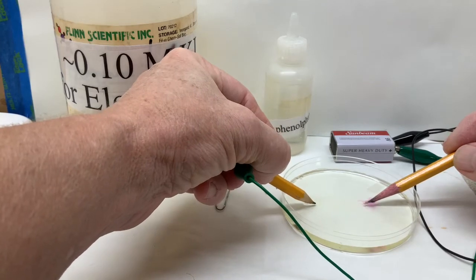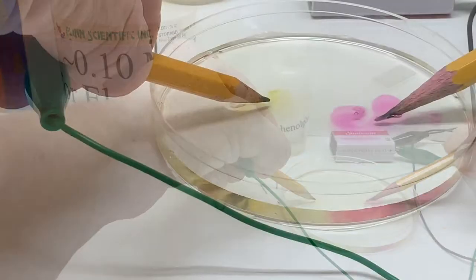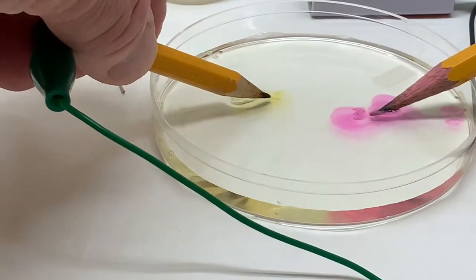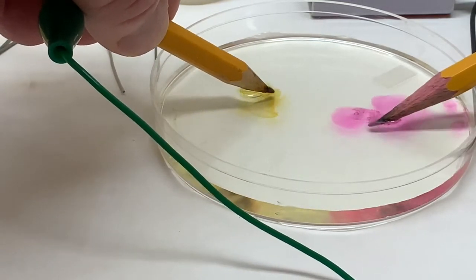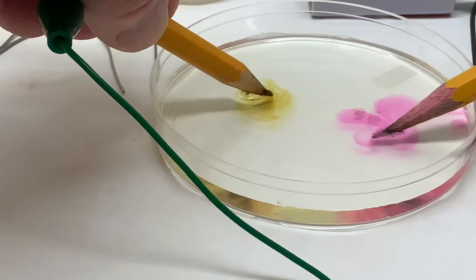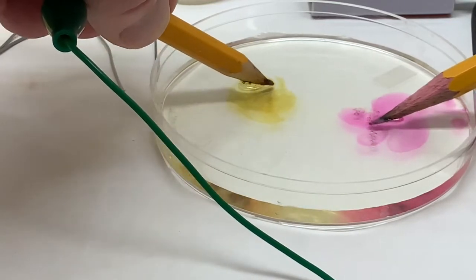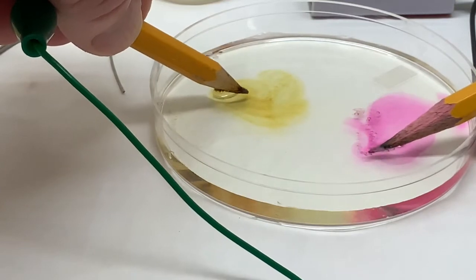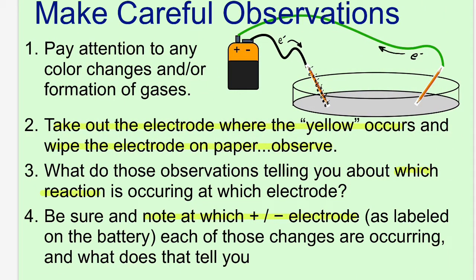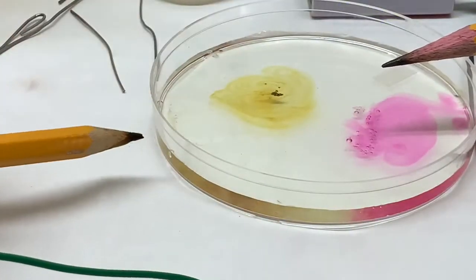Now it's time to make some careful observations. To help identify chemicals that are present, observe when the pencil attached to the negative end of the electrode is taken out of the dish and wiped on the paper.